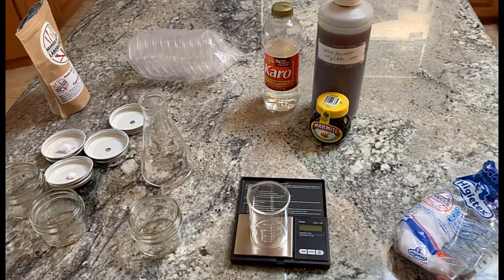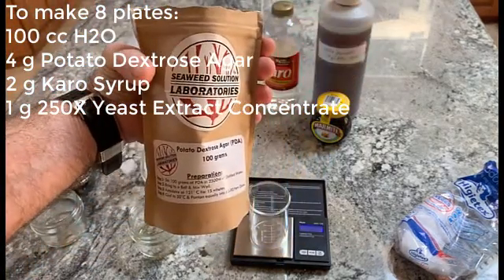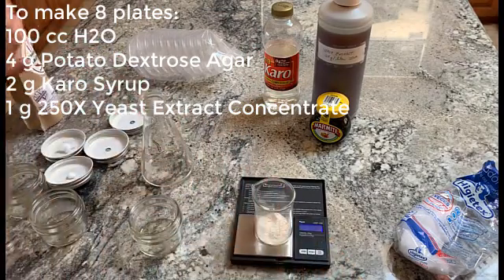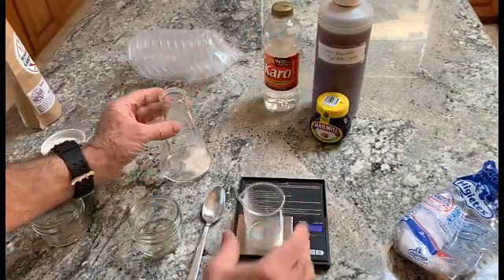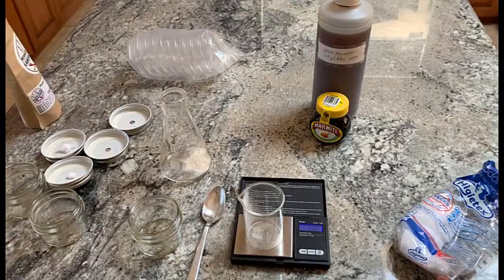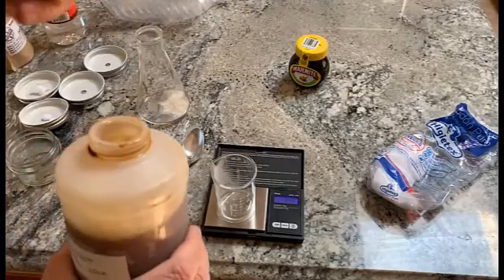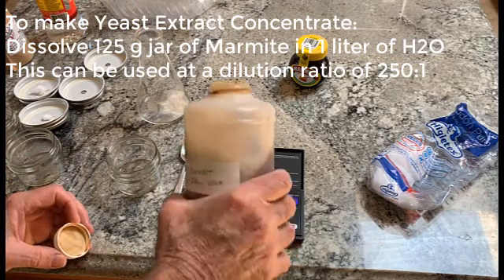It seems to work for every species of mushroom. The formula to make a hundred milliliters is 4 grams of potato dextrose agar, plus 2 grams of Karo syrup and 1 gram of yeast extract roughly.